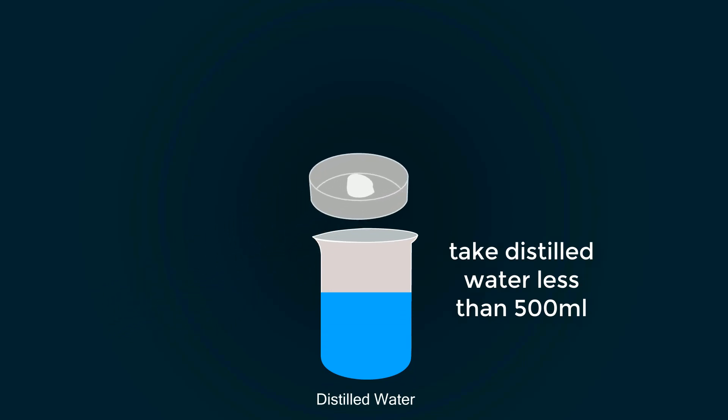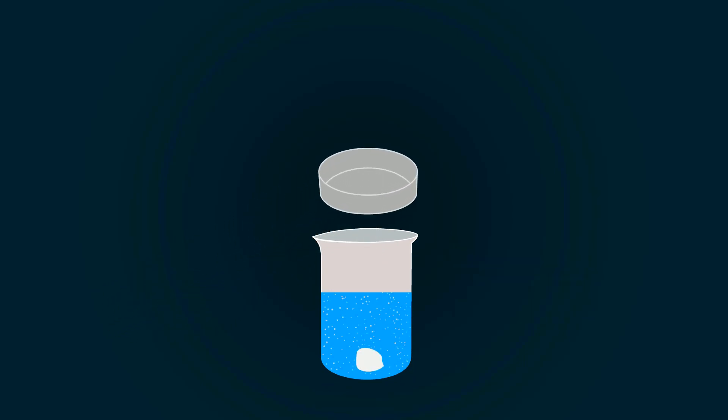Now take some water in a beaker and add that silver nitrate into it. We have to mix it so we can get homogeneous mixture.